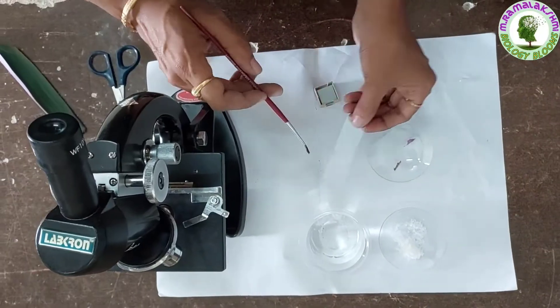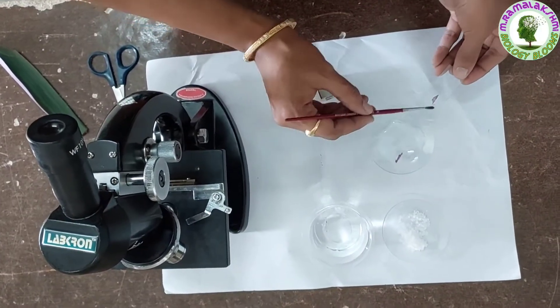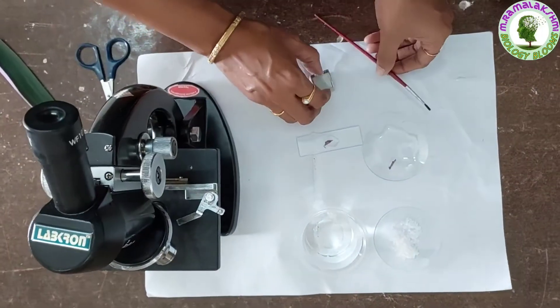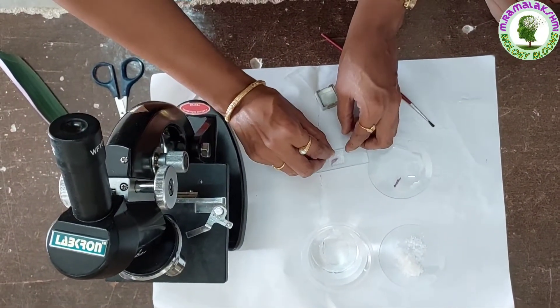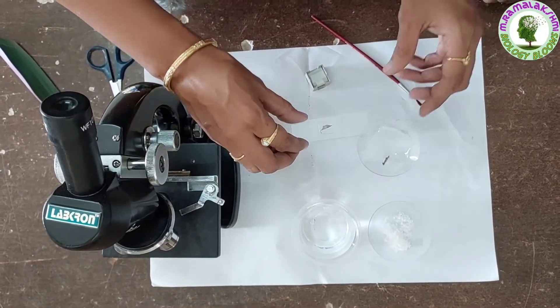Now put it on your slide and put a drop of water on it. Cover it with the cover slip. Place it under the microscope.